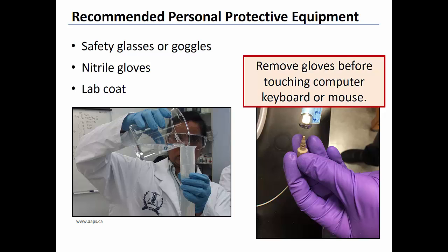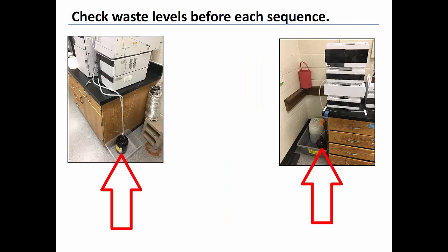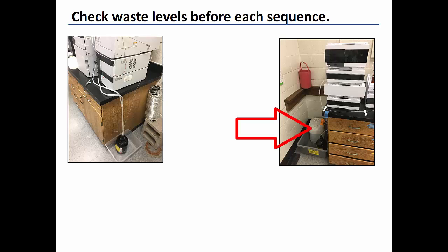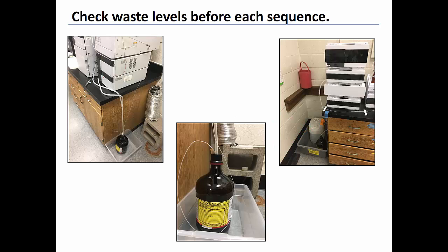Be sure to check the level of the mobile phase waste in the waste container before turning on the HPLC pump. The waste bottle must be stored in a secondary container. If the waste bottle is more than 80% full, empty the bottle into the bulk waste container before beginning your analysis. When uncapping waste containers, take care not to kink the tubing. A good procedure is to hold the cap and tubing stationary while rotating the bottle until the cap is released from the bottle.